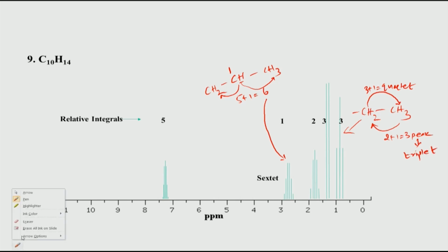So, you see that is how we can think about it, and therefore this quartet and triplet which we are expecting could be this quartet, sorry, this is a quintet here. So, there is no quartet. So, that means this particular possibility is not there.